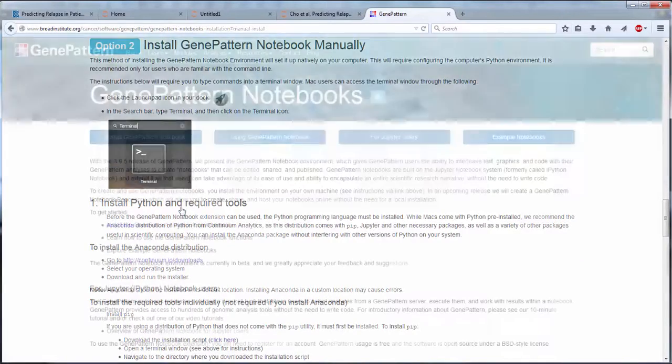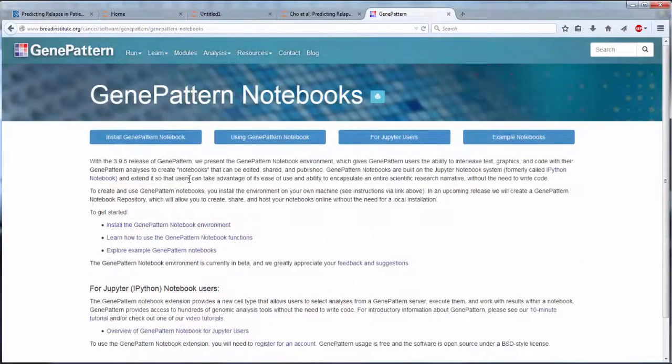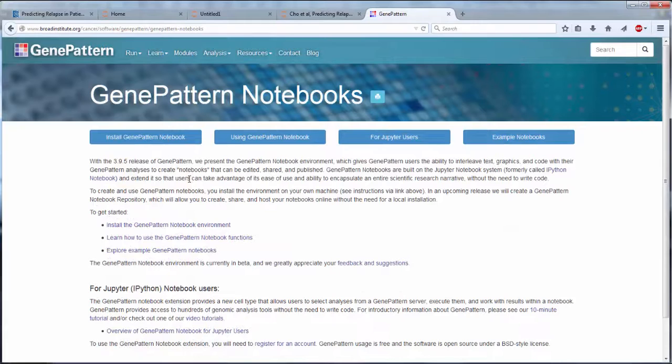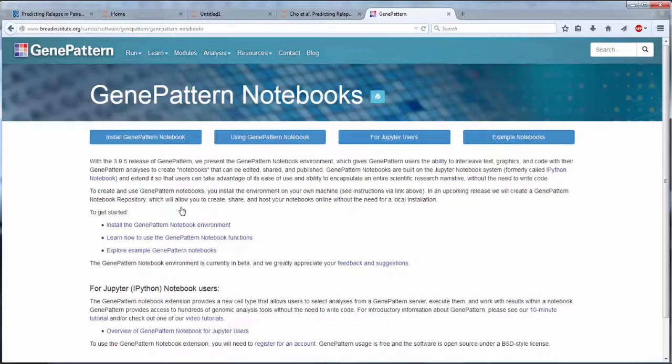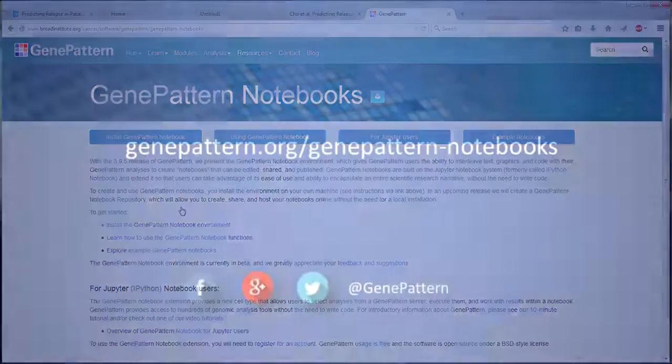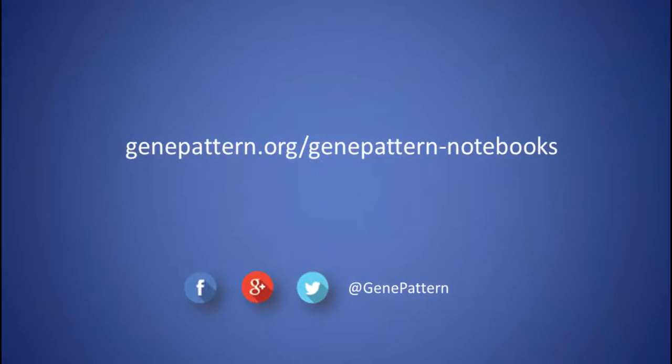You've now been introduced to the GenePattern notebook environment, a seamless integration of the GenePattern interface and the Jupyter notebook, and have been shown how easy it is to use and install for non-programming and programming users alike. For more information, tutorials, and examples, please visit GenePattern.org/GenePattern-notebooks.